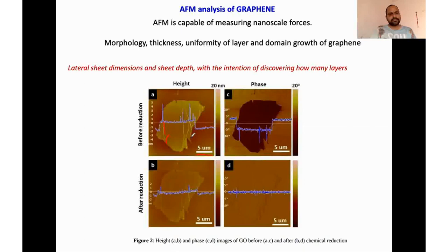Based on the up and down, basically the topography, if you have a fixed tip height, the number of electrons tunneling may vary. Or you can keep a fixed number of electrons, and then the tip will move, or there will be a change in the current. Either signal can be monitored or measured, and then we can generate an image.